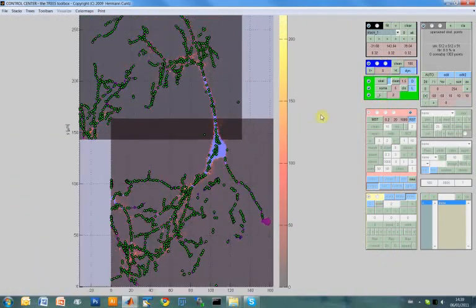We can also automatically look among those carrier points for which one could be a soma. There's a soma button here, and it finds this one here as being the soma because it's the point where this thresholded image is the largest. This has a threshold here which we can actually change. So I can, for example, put it down to 1, press this button again, and then it will find many more. But the first attempt was much better, so I'm just going to clear all the somata again, and then put the threshold back to 5, and then press the soma button again.